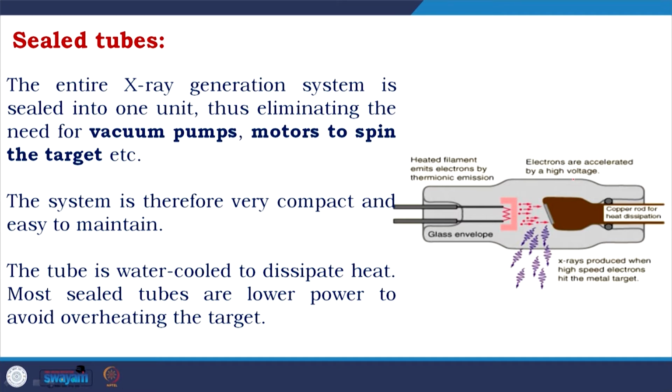So, you cannot generate powerful X-rays because with the increasing energy requirement, the heat generation would also be enhanced, and that is not good for the safety of the instrument, hence the safety of the experiment.